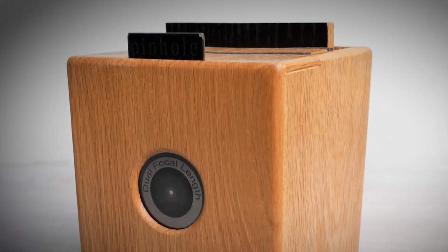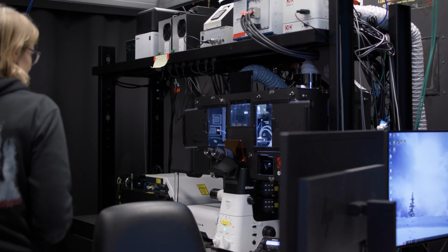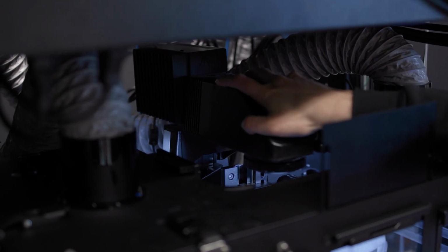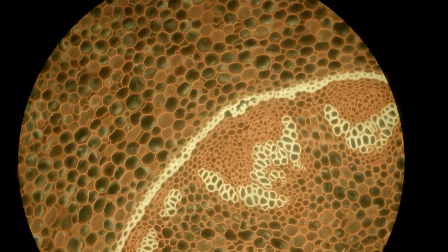Now, how does a confocal microscope achieve that? It actually takes advantage of a very, very old trick called a pinhole. Yes, that is the exact same pinhole that you use to create a pinhole camera when you were still in high school. In operation, the entire biological sample is actually illuminated from top to bottom. And as you can imagine, all the fluorescent molecules inside the biological sample, upon illumination, will emit their own fluorescent light. Now, with the pinhole, only the emitted light coming from that specific confocal layer will get through the pinhole and be registered as an image.